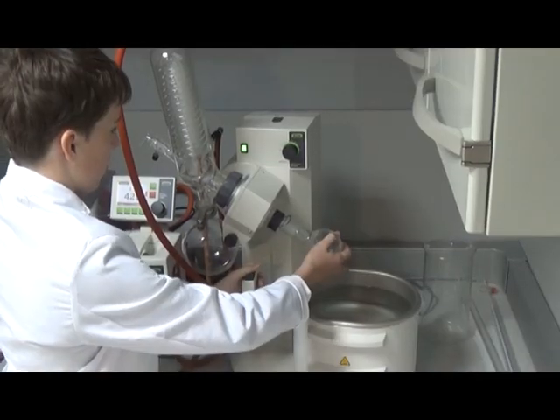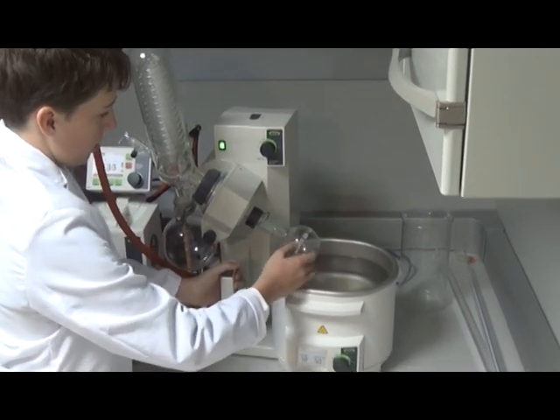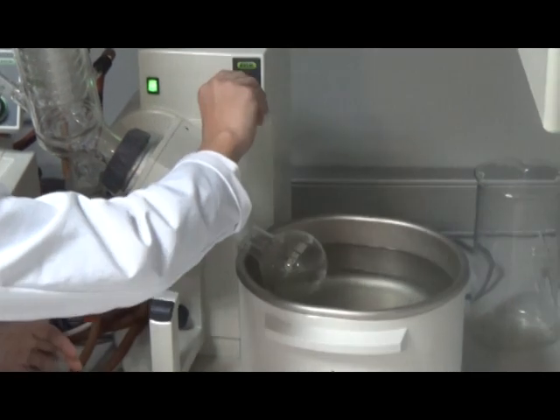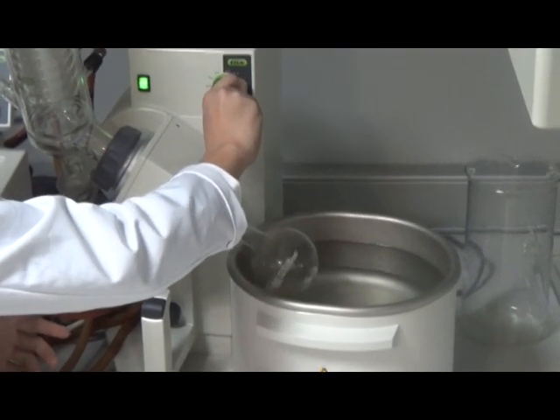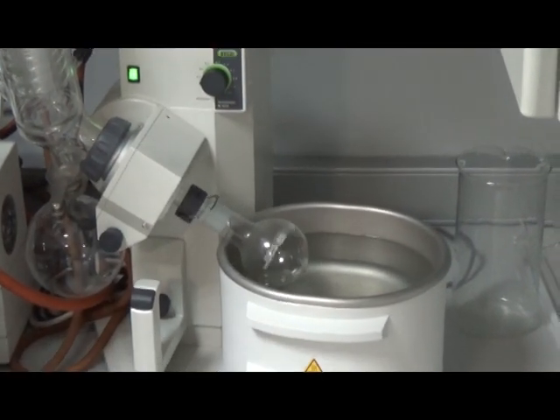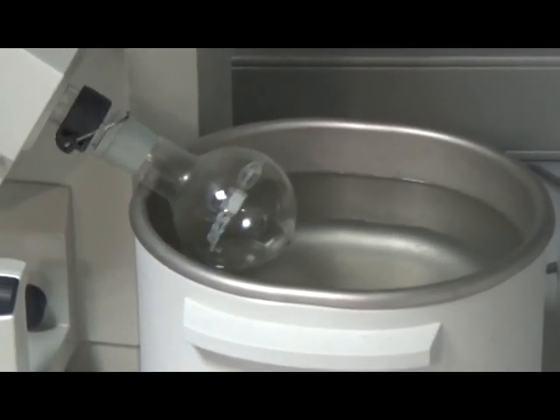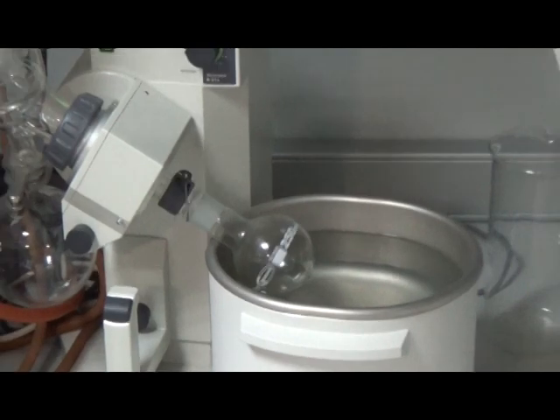Now we use the rotary evaporator. Using a vacuum, an increased temperature of 50 degrees and rotation, the dissolved chloroform is gently evaporated, leaving behind a thin dried film of phospholipid. The film can be seen on the surface of the flask.